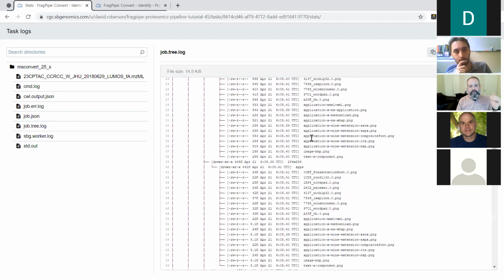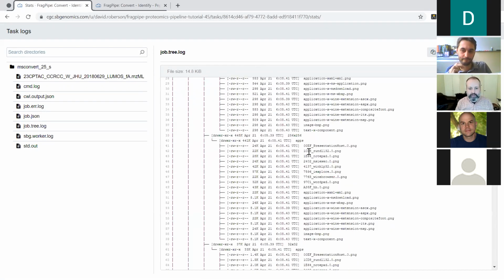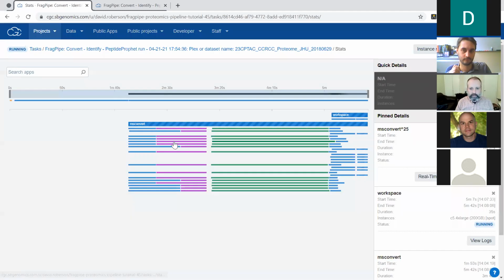So what we came up with was, it's expecting the workspace to be in one place. So what we're doing is we're passing a directory from step to step. And you'll see that later on if you want to look at it.